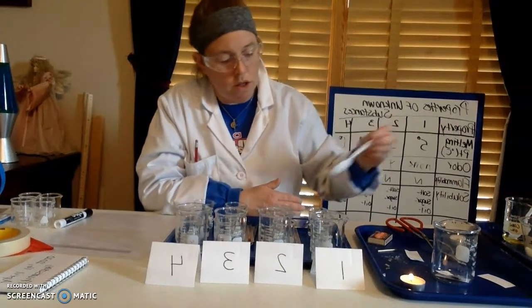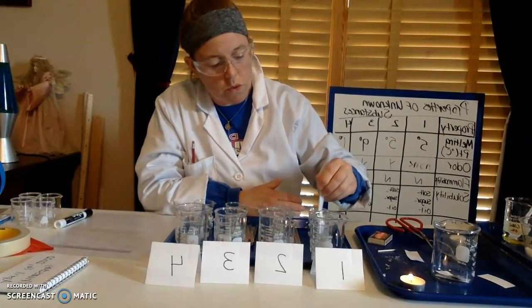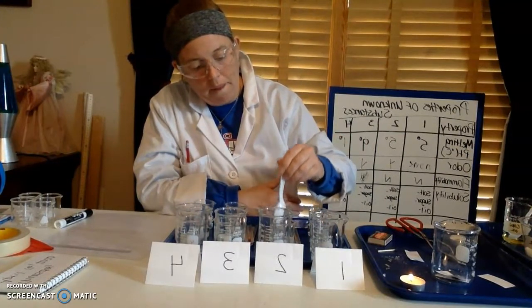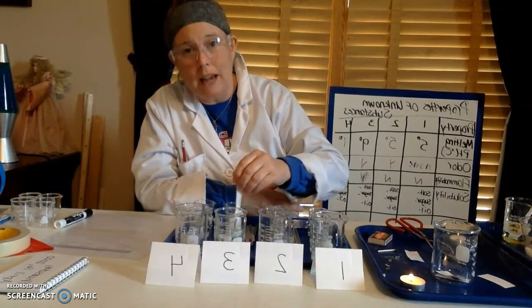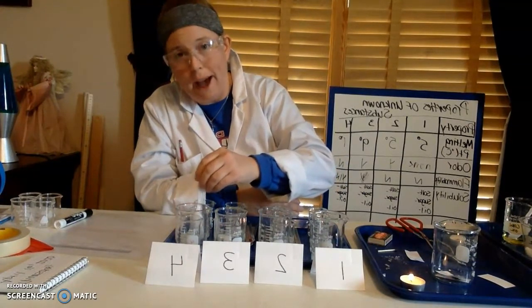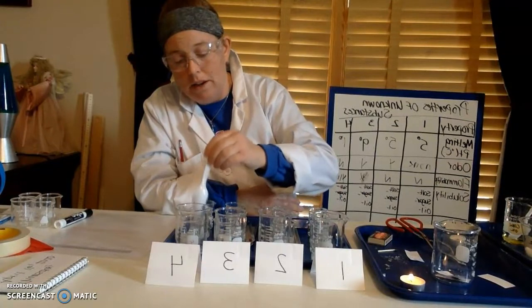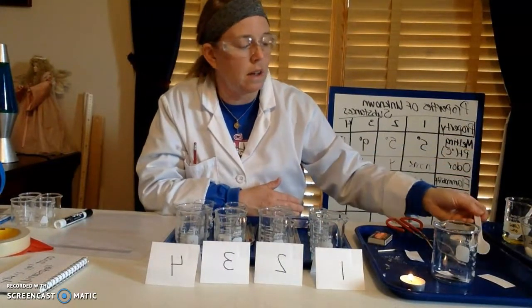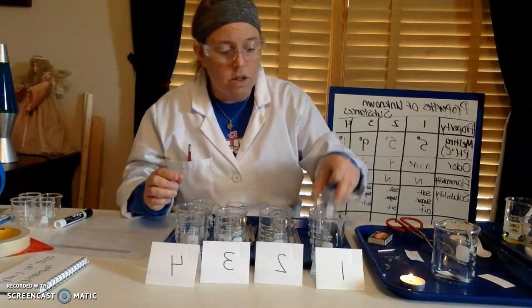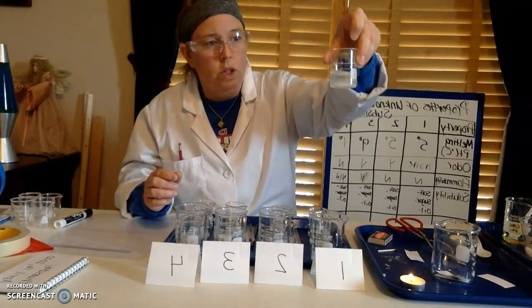I'm just stirring these, and I'll give you a visual. Obviously, if I had more time and allowed these substances to sit here, we would have better results. And you would be seeing a lot of these results also if we were in the lab ourselves.